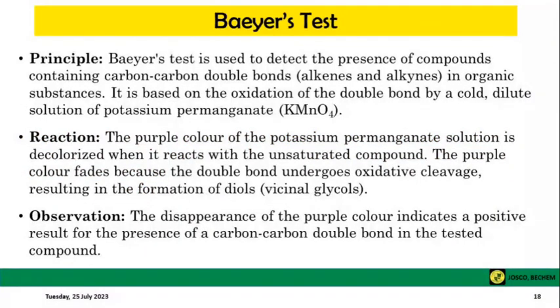The first test that we are going to look at is the Bayer's test. Now, the principle behind this test is the oxidation of the double bond.